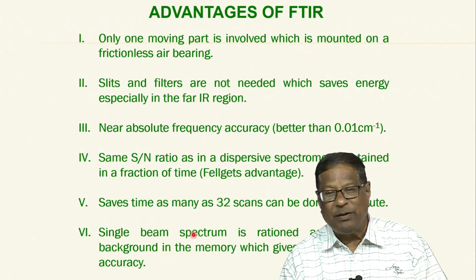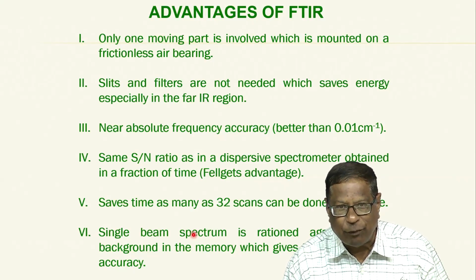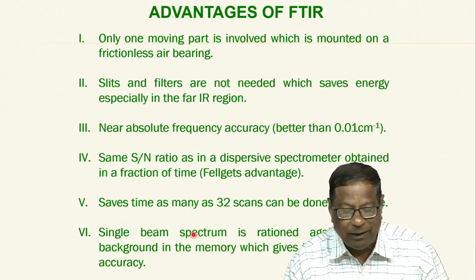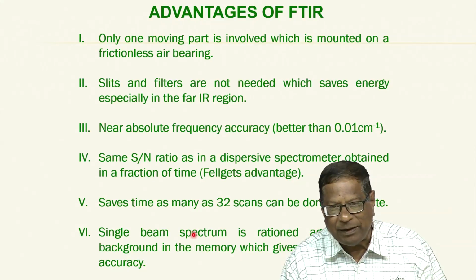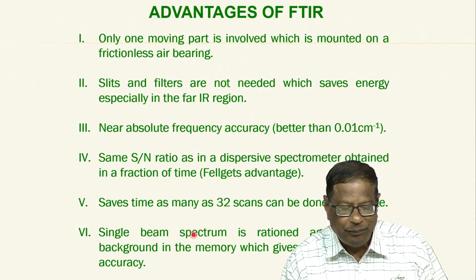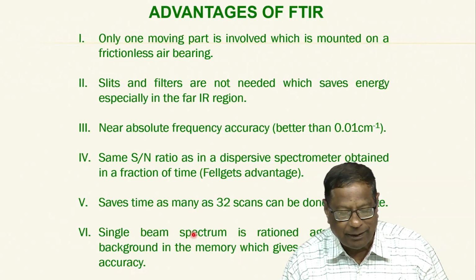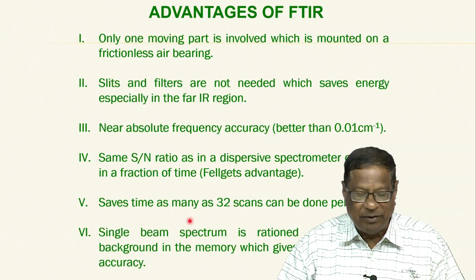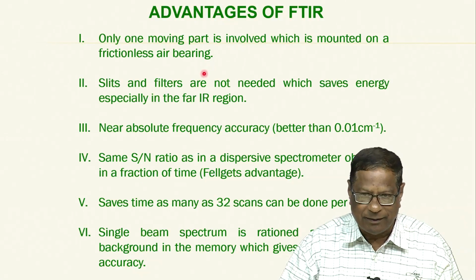I am not going into details of what is a Fourier transform and what is a Fourier equation, etc. They are all taught at BSc level. The Fourier equation is basically an infinite series, and the actual equation I can present to you in the next class, but basically it is a non-ending, continuous infinite series.